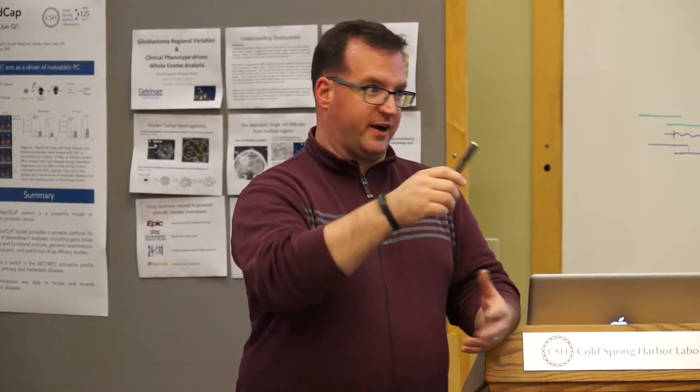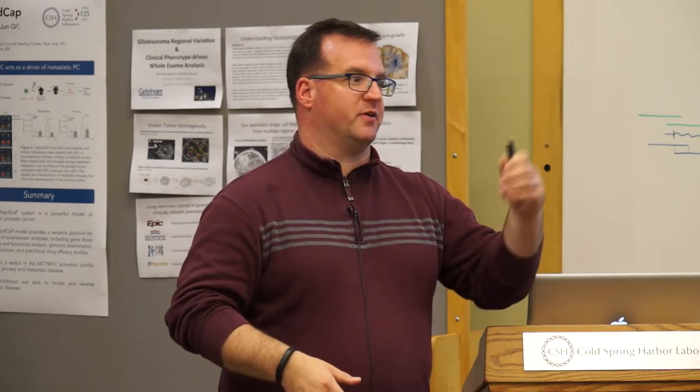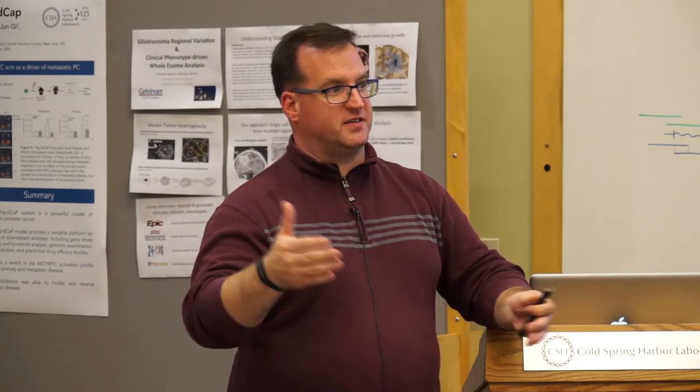So when we talk about RNA-seq and genome assembly, we're gonna talk about SNPs tonight. There you're gonna talk about how much coverage you have: 40x, 50x, 100x coverage, depending on whether you're genotyping or de novo SNP discovery. So it depends on your application.